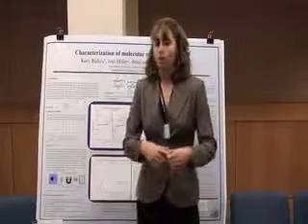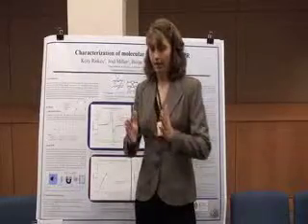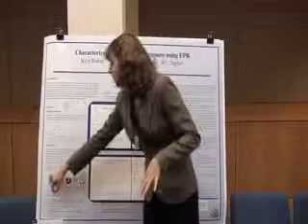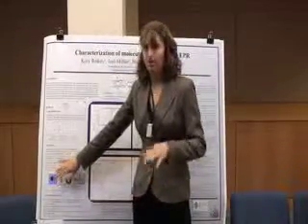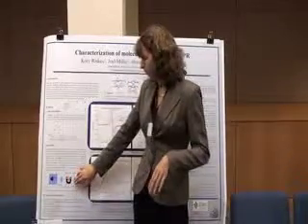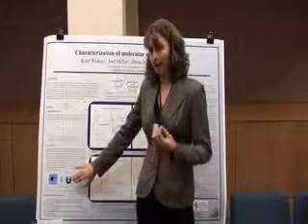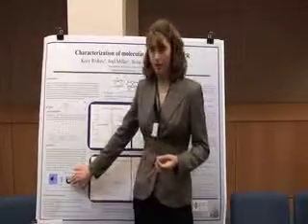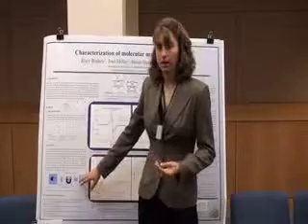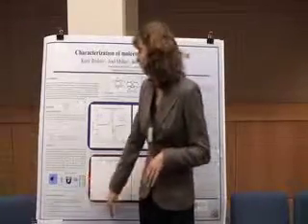And so when we scan a magnetic field, we have our sample in a magnetic field. So this part of the ESR generates a microwave, which is amplified, and our sample, which is under an external magnetic field, is exposed to this microwave, and then the absorption curve is plotted. The first derivative of the absorption curve is plotted.